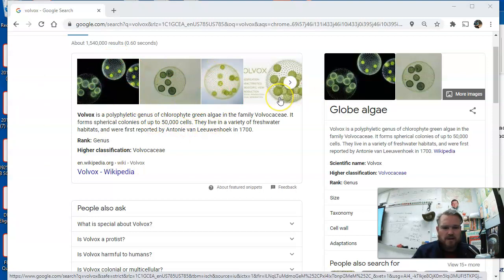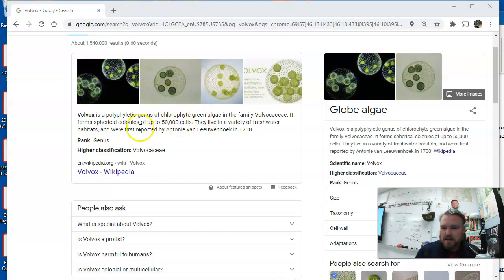The ones you saw on the microscope were kind of a purplish color. That's just because they're stained that color. If you see them in real life, they're green. Kind of cool. Anyway, they're colonies of cells. They're not a single cell. Some colonies, it says, can be up to 50,000 cells. That's a lot of cells. They basically are colonizing together and working together to create something that works for the common good, as it were.